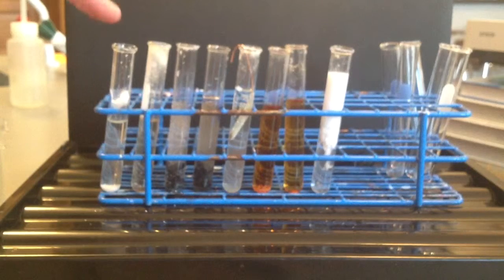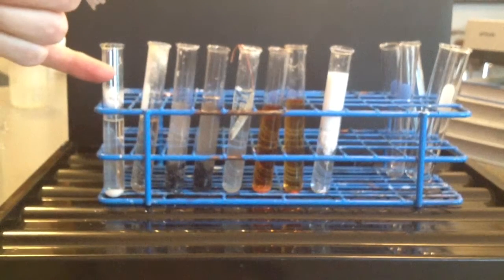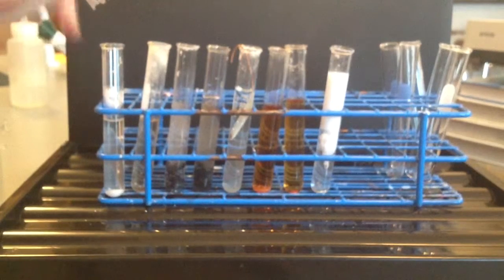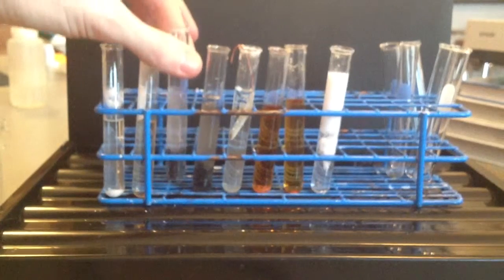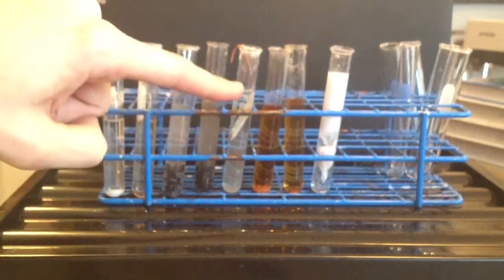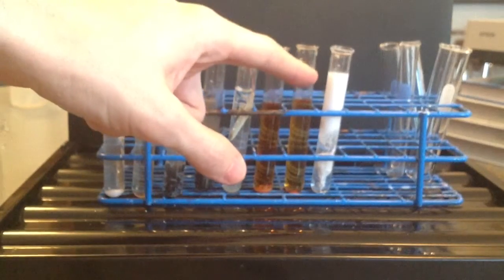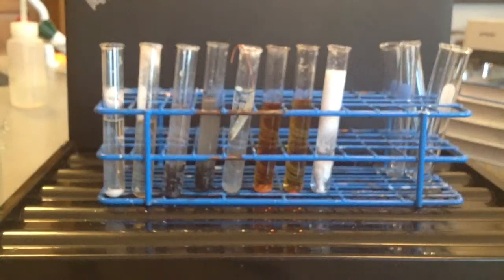Just to recap, remember this is the first one that we did, which was the hydrochloric acid and, oh no, I'm sorry, sulfuric acid and calcium carbonate. This is the acetic acid and calcium carbonate. This is the zinc and hydrochloric acid. This is the zinc in acetic acid. This is our copper wire and silver nitrate after about 10 minutes. Chlorine water and potassium iodide. Bromine water and potassium iodide and silver nitrate and sodium chloride.